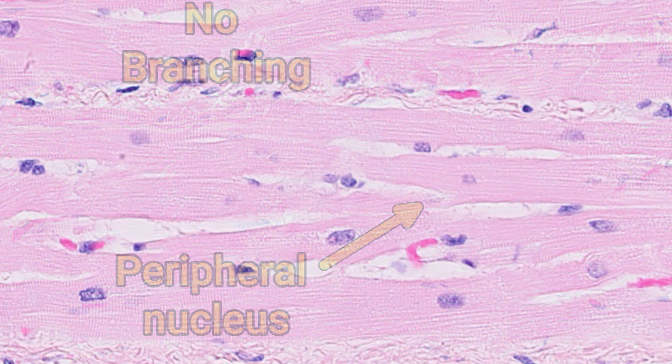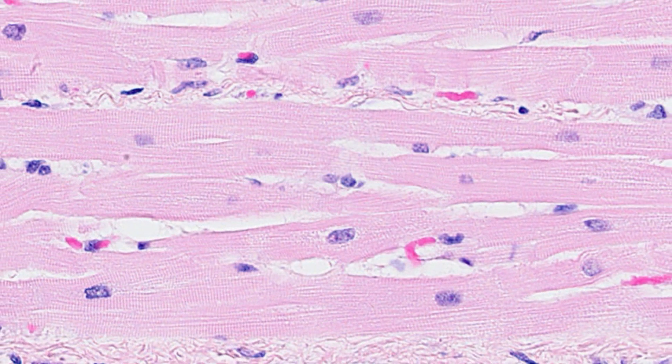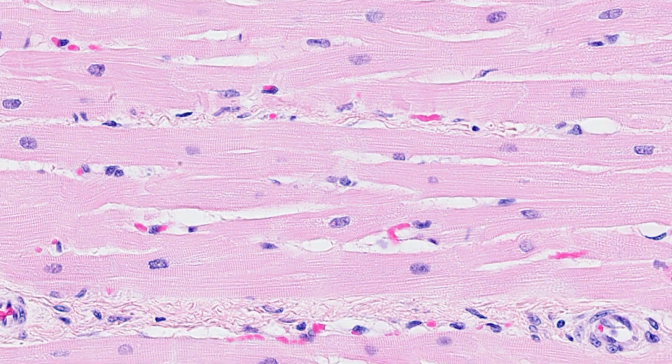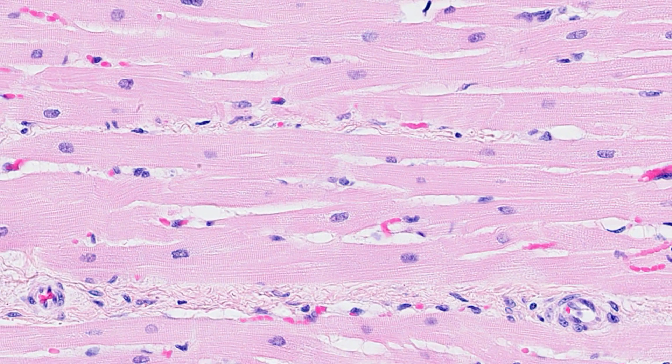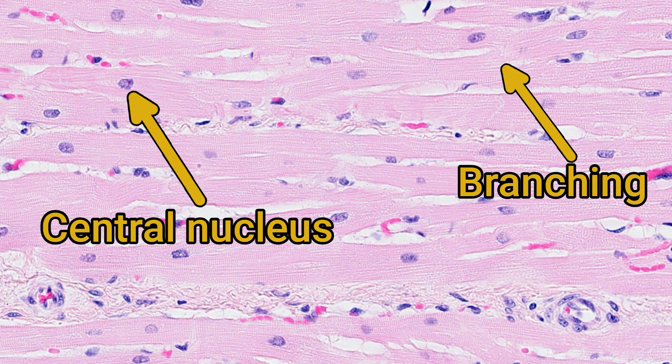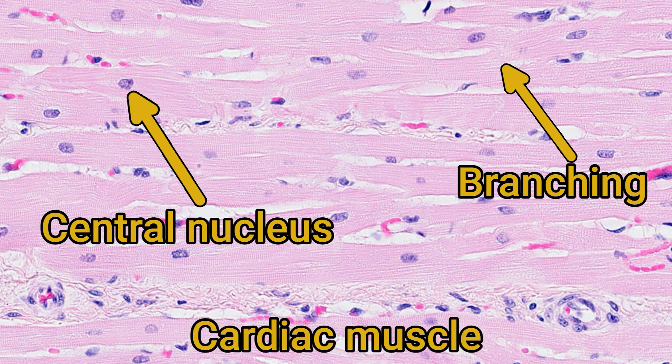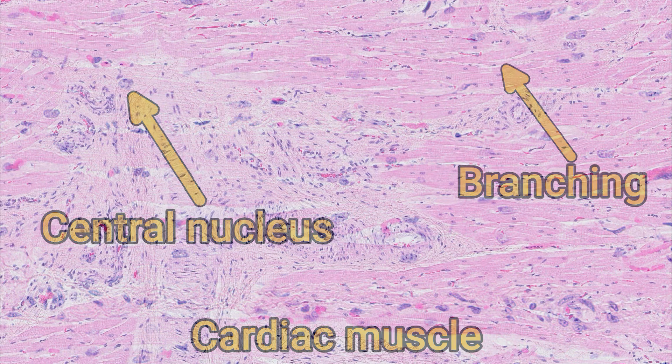If you can spot either of those features — a central nucleus or branching between myocytes — you should be able to tell the difference between skeletal and cardiac muscle even without the wider context of an entire organ section.